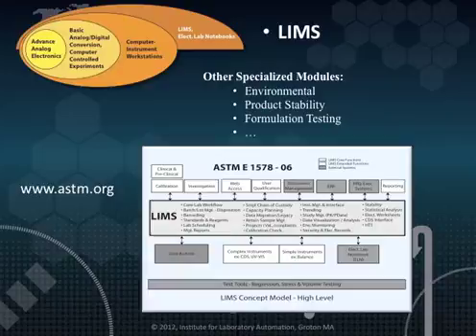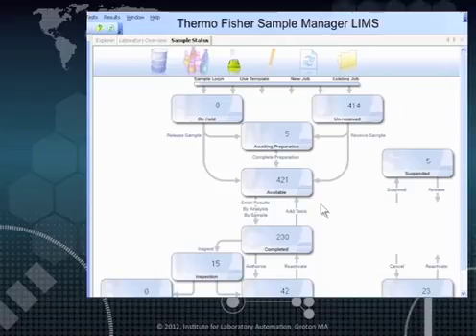The chart on the screen shows some of the elements that the database is built around, as well as the connections to other software and laboratory functions. Going through the contents of the chart at this point would be a lot more detail than we can afford. If you're interested in looking into this more deeply, you can purchase the guide from the ASTM. There are a large number of products available for this application. The illustration you see on the screen is an example of one.